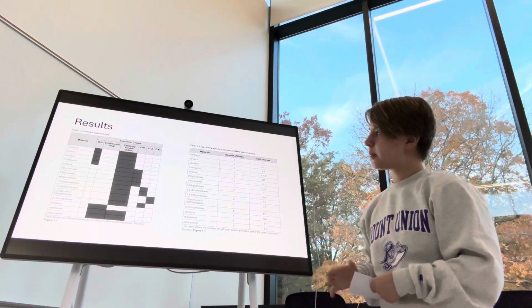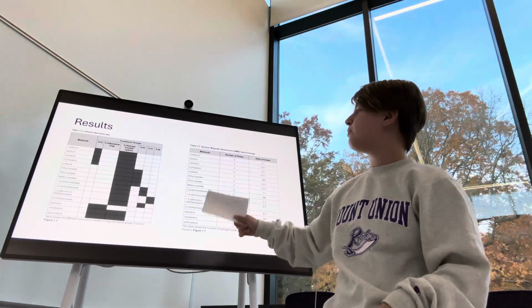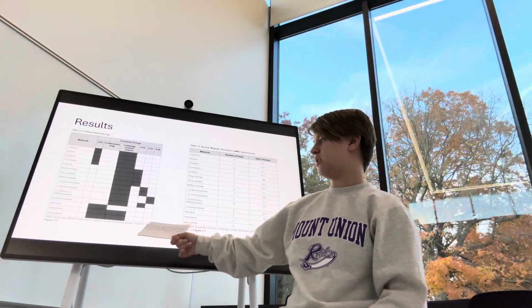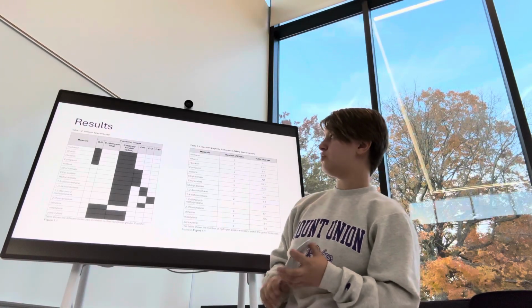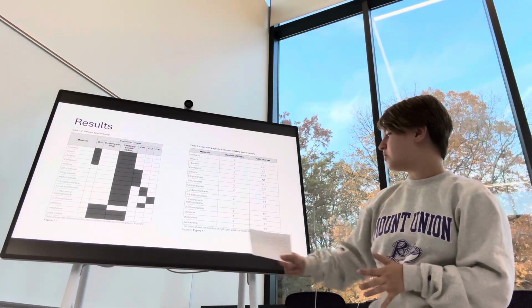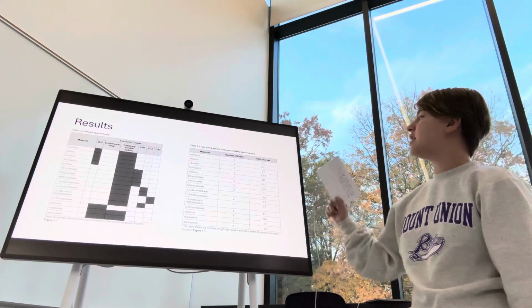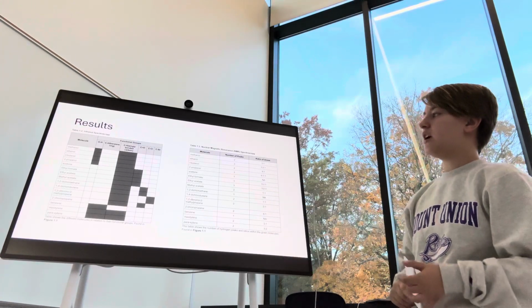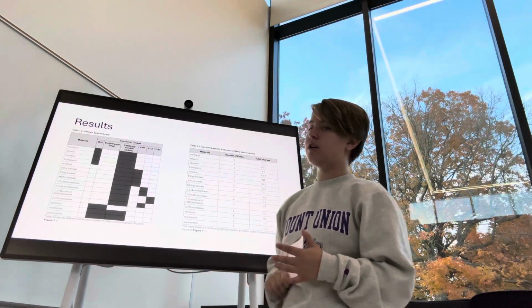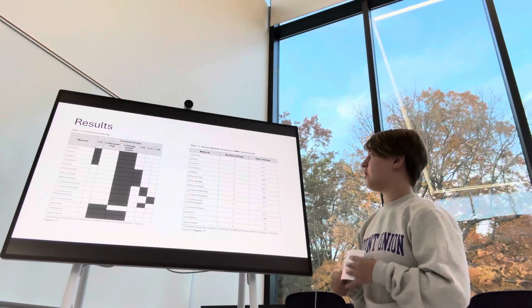And the results. Both table 1.2 and table 1.3 were found based off of the Lewis structure. Table 1.2 shows the different molecules in relation to their functional groups. So this is the infrared spectroscopy one. Then table 1.3 shows the number of hydrogen peaks and ratios of each given molecule. And this is the NMR spectroscopy. 2-propanol had an OH bond and a CH singly bonded carbon. Then it also had 3 hydrogen peaks and a ratio of 6:1:1.